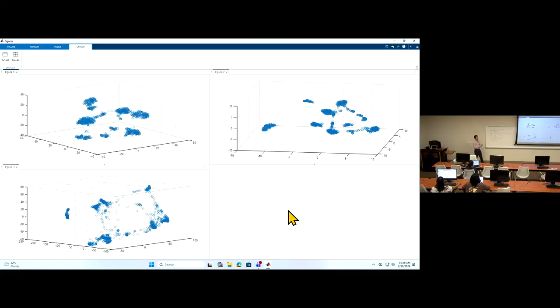If I don't tell you which one's from which, you can figure it out later if you use these 3 different methods on the same data set more and more.